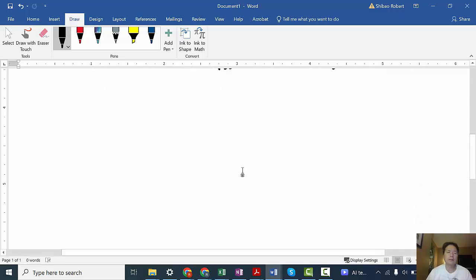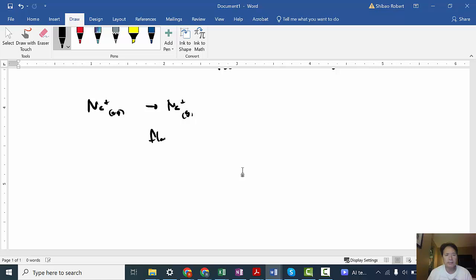For the sodium ion test, it's just this. We have our sodium ion aqueous, and then we put it into the flame, so that makes sodium ion gaseous. This is flame. And then in the flame, there are free electrons floating around. So in the flame, the sodium ions can get reduced to elemental sodium atoms, metal, in the gaseous phase. And then in that flame, the sodium atoms get excited to some excited state, but they don't stay there forever.